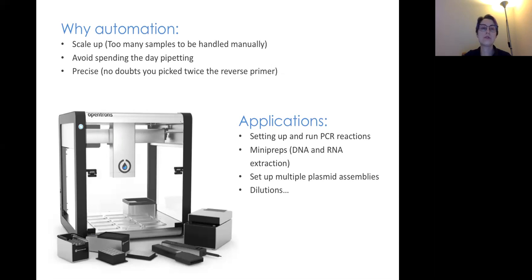And of course, when you have a big experiment, and I'm talking here maybe more about industry, but also in the lab, when you want to try a lot of different conditions in your experiment. For example, when you want to optimize your conditions, then you want to try as many different ones as possible, and then the robot helps. The OpenTrons can do a lot of things.